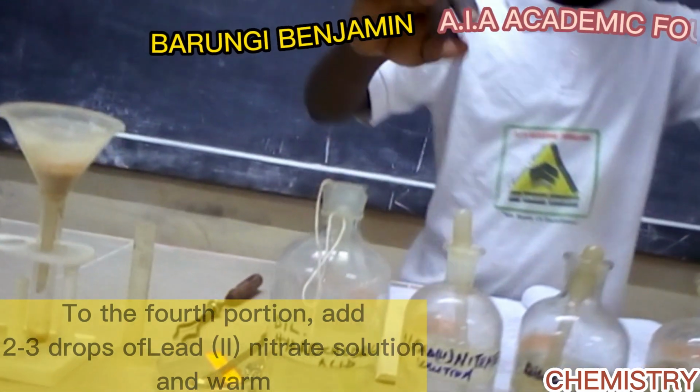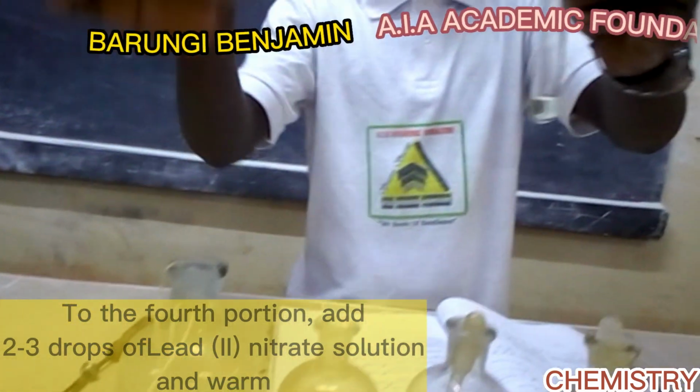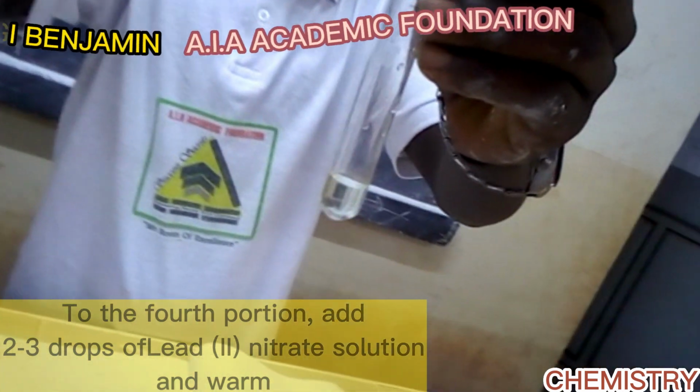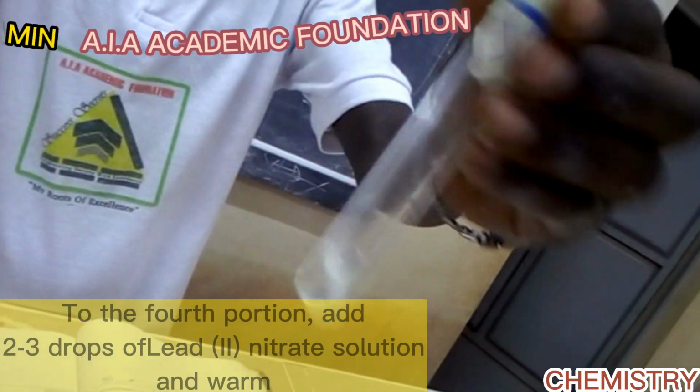So we are going to add lead 2 nitrate. This is our lead 2 nitrate. 2 to 3 drops, 1, 2, 3.